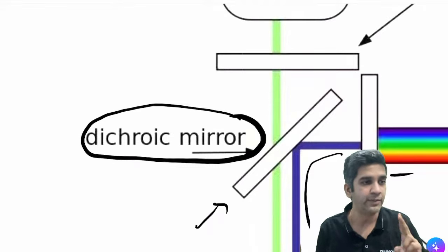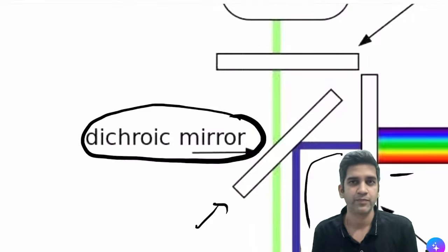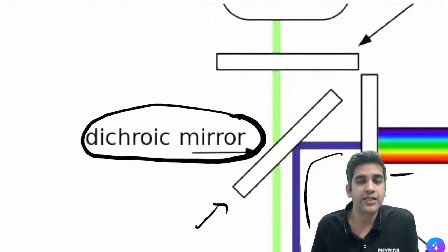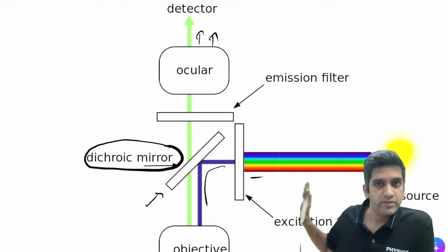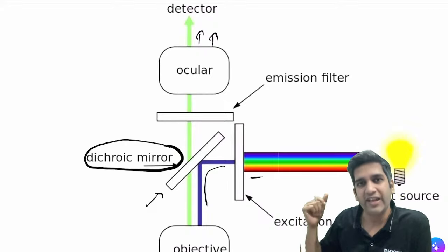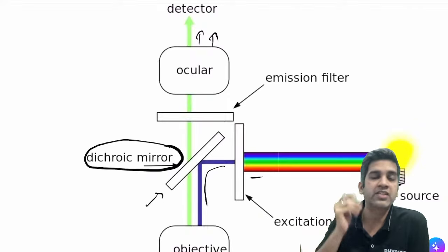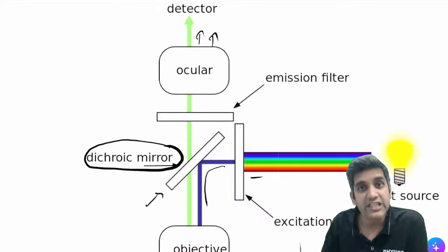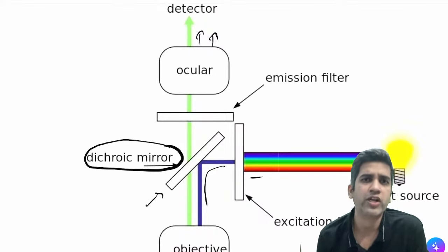So can anyone tell me, based on this concept, what will be the microscopic color of this image? What all colors do you think you will see when I'm doing fluorescent microscopy? This is a simple mechanism. I have a white light. Excitation filters take out everything. It hits the image at one wavelength, reflects from the image with another wavelength, and that is passed through the dichroic mirror, as one more filter, and comes to the ocular or eyepiece, right?